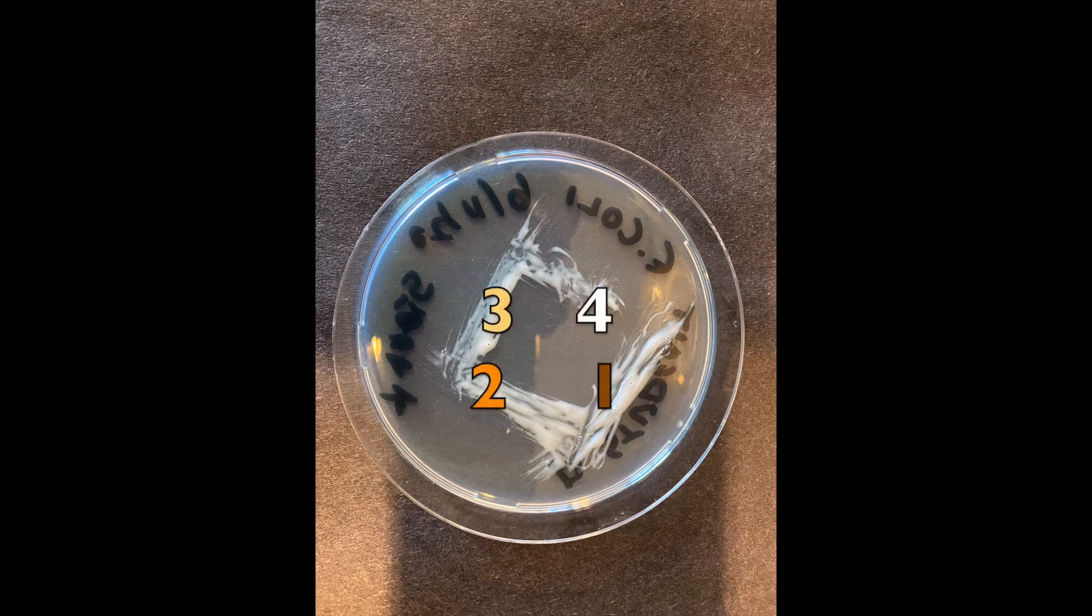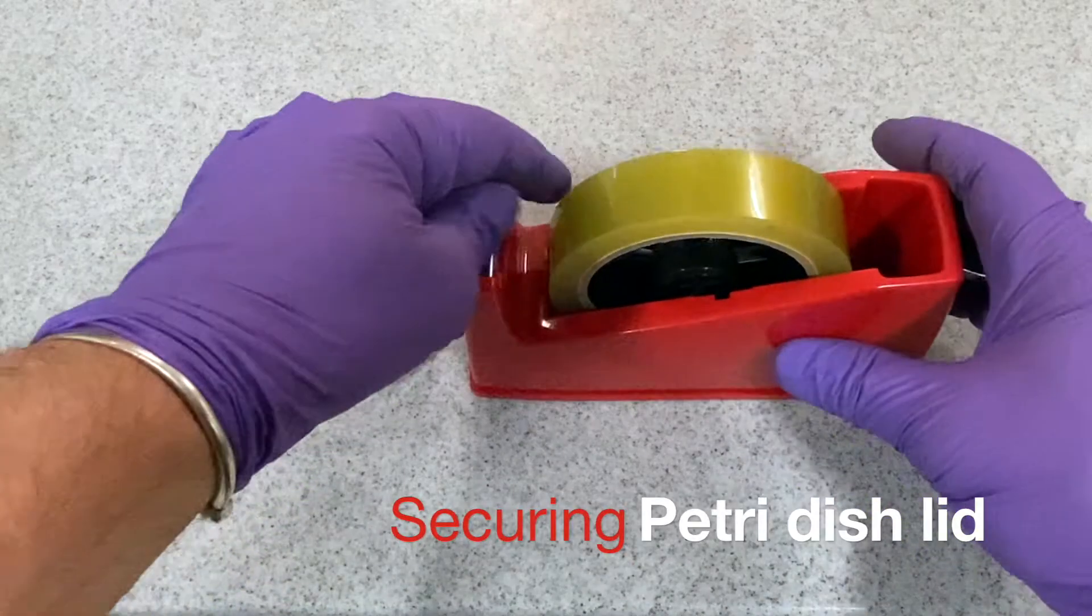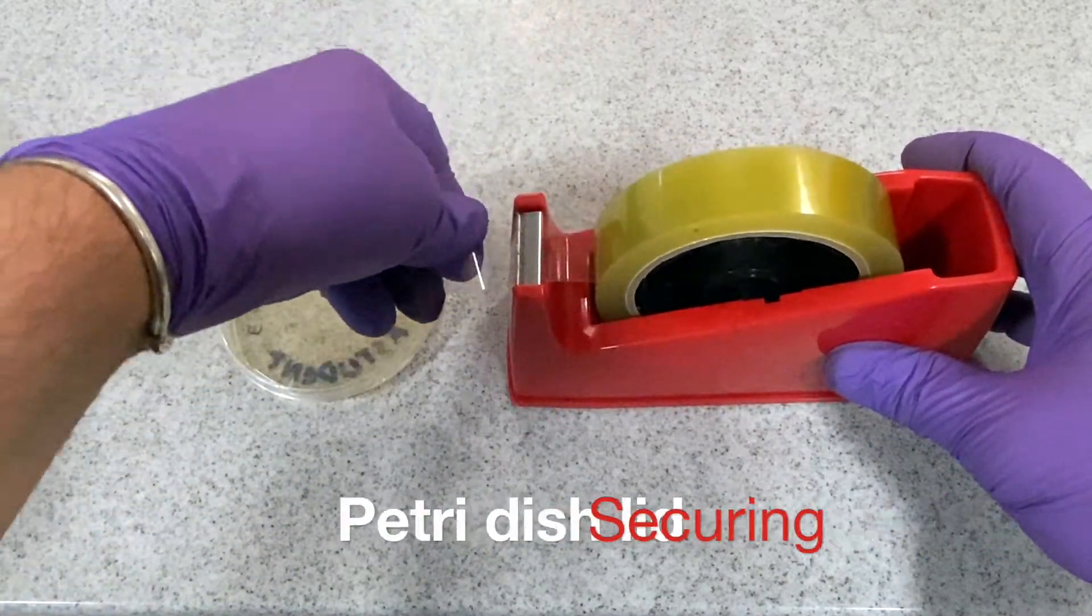Here is an example of a streak plate. The numbers appearing above the streak plate are graded in intensity of color. This will give some indication of the concentration of the bacterial colonies produced by each streak.